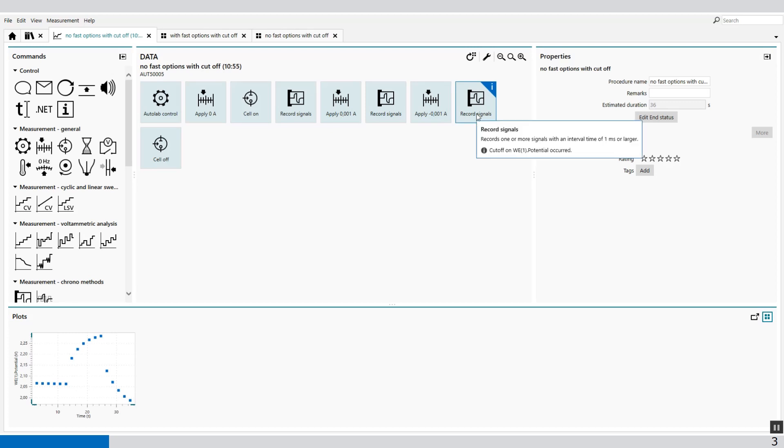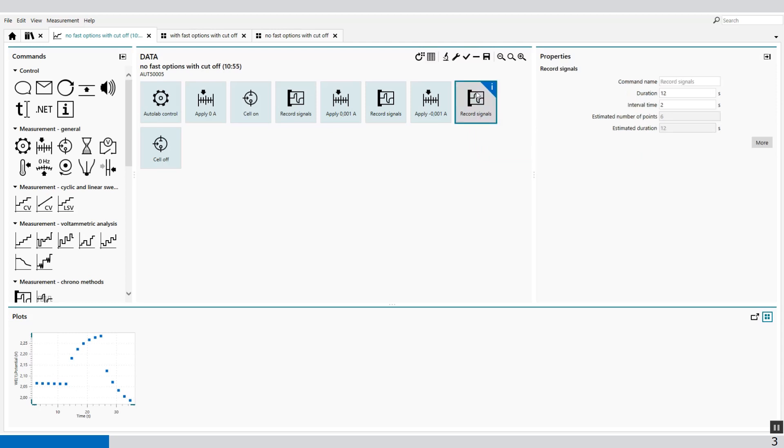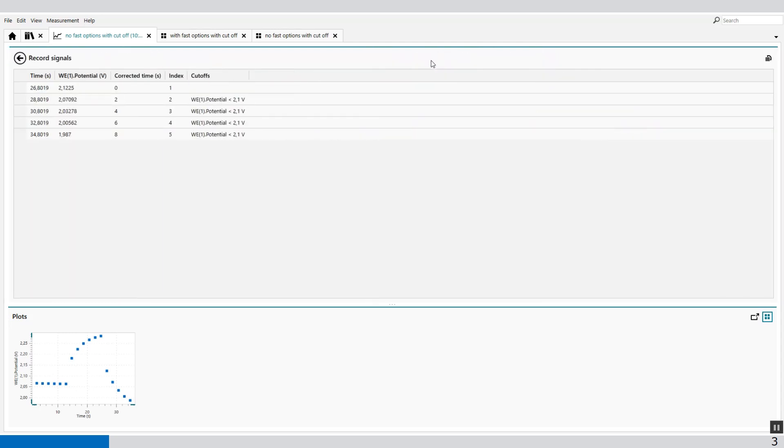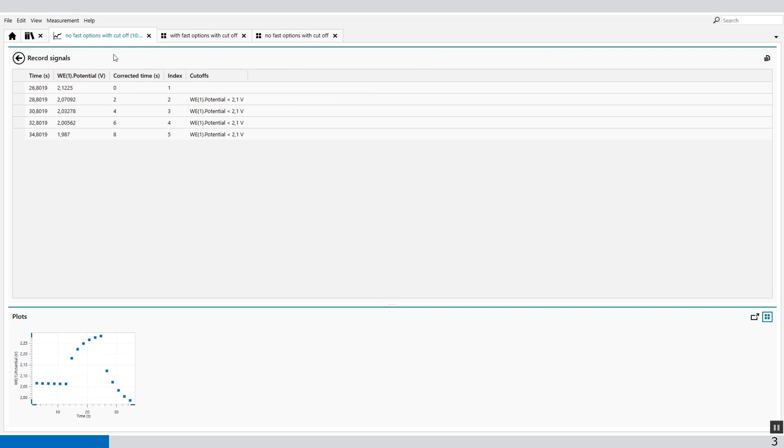So the cutoff occurred in the discharge. We can also look it up in the data, and we can see that we've detected four values below 2.1 volts.